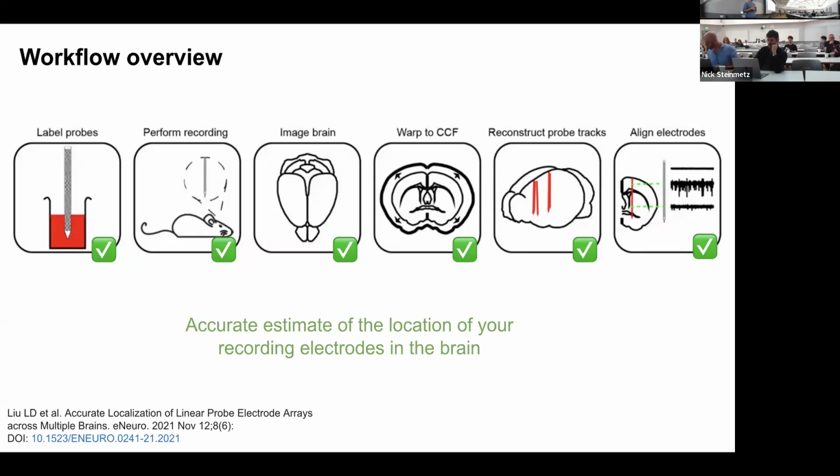Okay, I'll ask Mayo. I'm not sure we're going to know the answer to that, but we could also talk about it more later. The question is about a different kind of probe that's not Neuropixels, where the probe is very flexible, so you encase it in a stiffener that later dissolves in the brain. The question is whether you can coat the probe with the dye before or after you apply the stiffener outside the brain. Do you know the answer to that? No, I'm not sure either, but we can talk more about it afterwards.